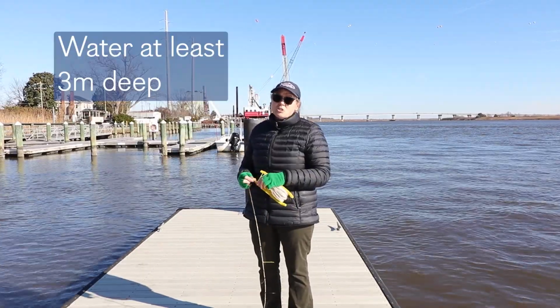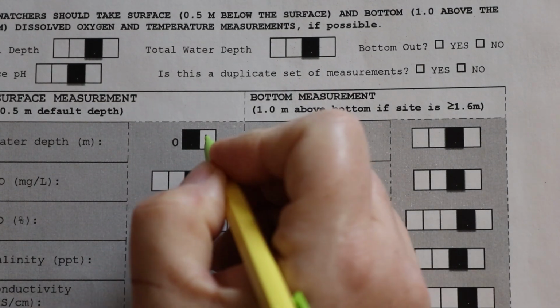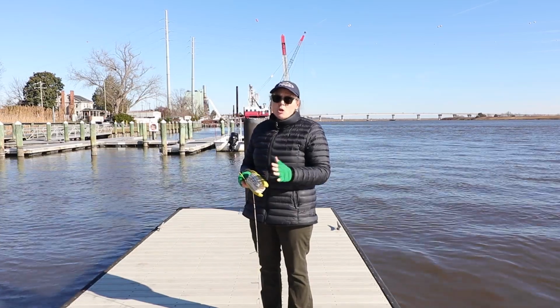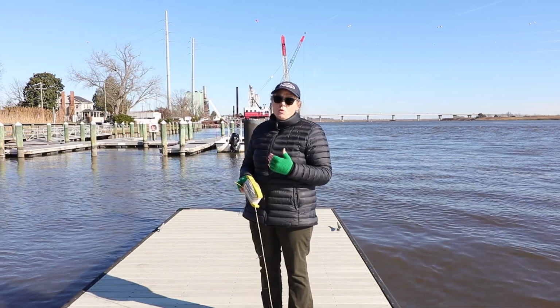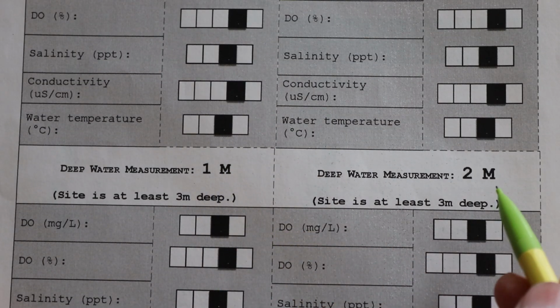So what that means is we're going to take our surface measurement at 1/2 meter or 0.5 meters deep. Our bottom measurement, we're going to subtract 1 from 4. That brings us to 3. And then we're also going to take measurements at the 1 and 2 meter increments.